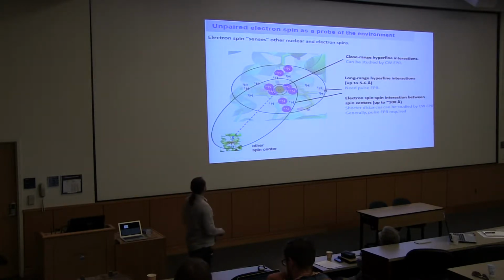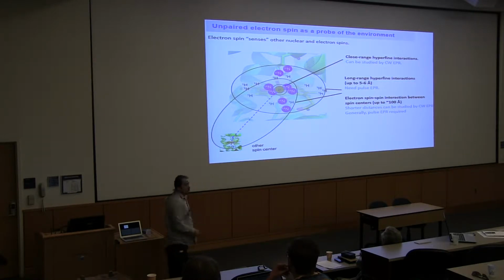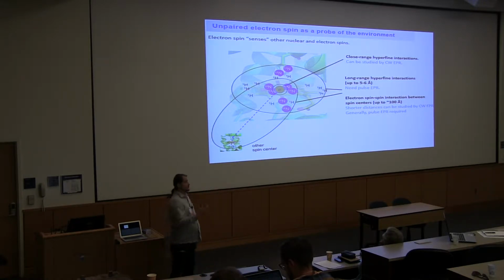And just to nail this information home, this is sort of a spectroscopic picture of a molecule. We'll have our paramagnetic center, let's say a metal. In this case, on the background, you see a hemoglobin, I believe, or myoglobin, actually. Then you would have immediate ligands that may be magnetic, and you'll have interaction between them. And if you are lucky, you will be observing them in continuous wave EPR. But in many cases, we are interested to see a little bit more. We want to learn more about the electronic structure of the system. We want to learn about the structure of the system.